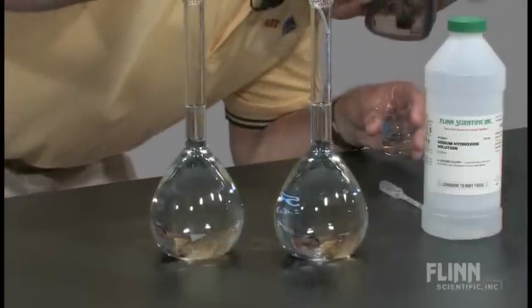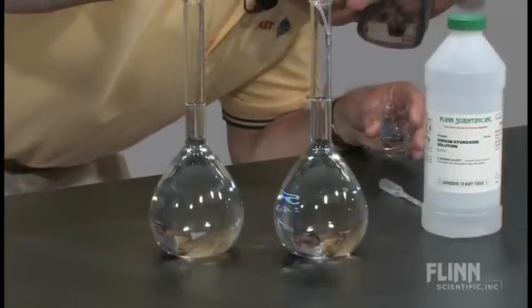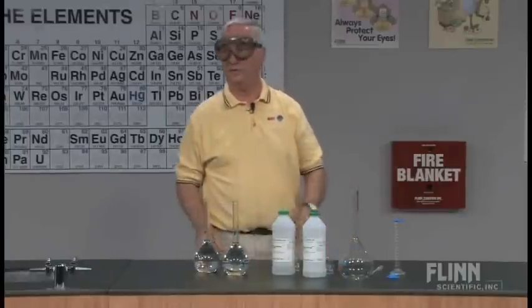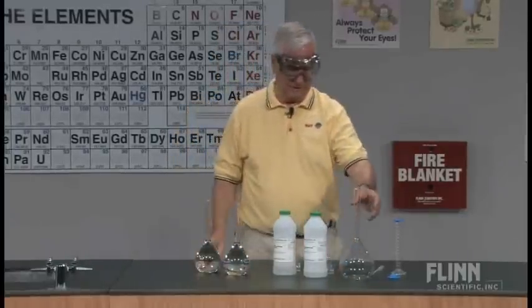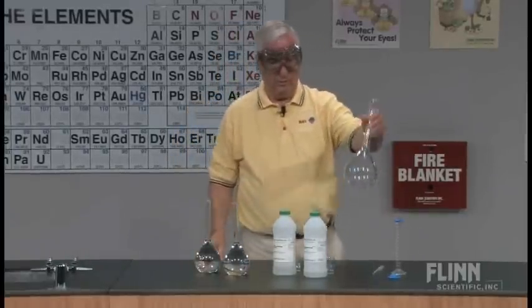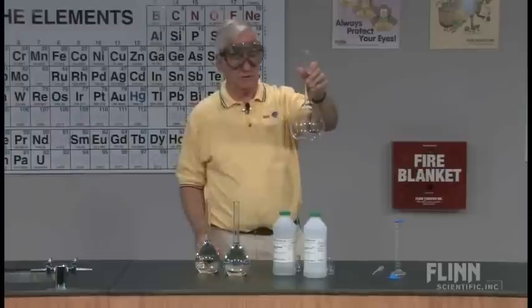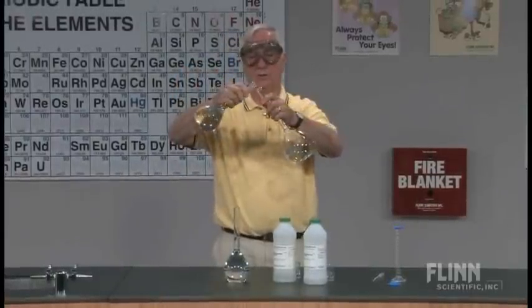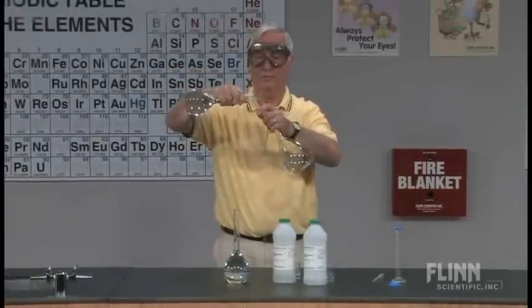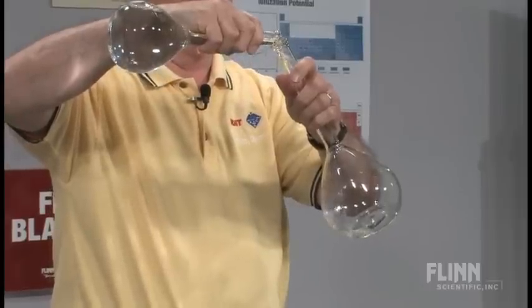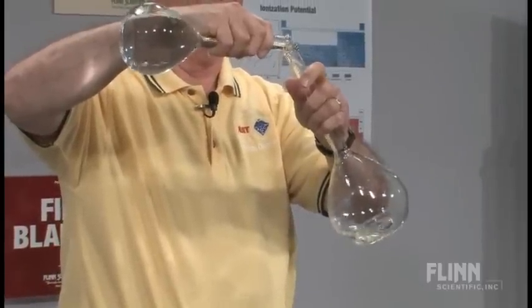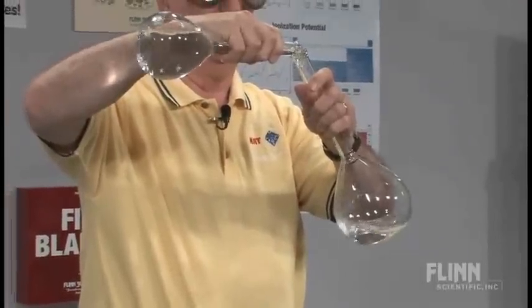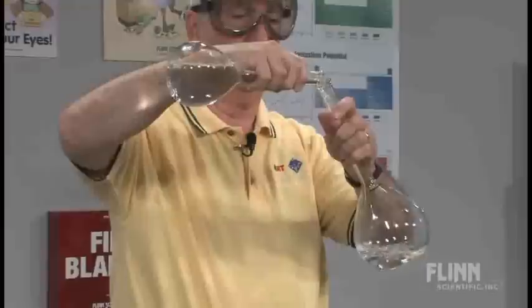Now once we have exact quantities, we have 500 and 500. Is there a time when 500 plus 500 does not equal a thousand? Well, I have a one liter volumetric flask here and I am now going to transfer the first — the base solution — pouring carefully, and we are going to get the full volume into the flask.